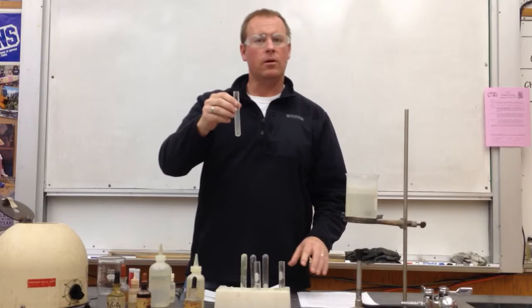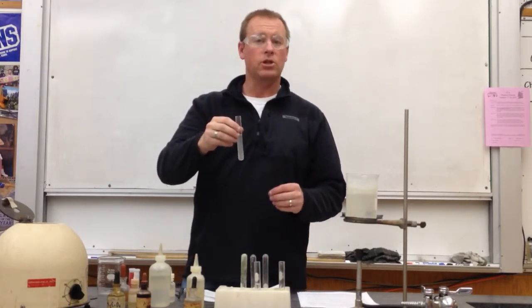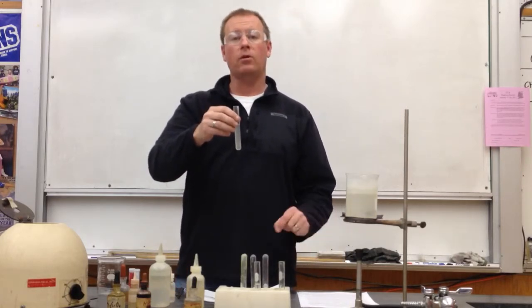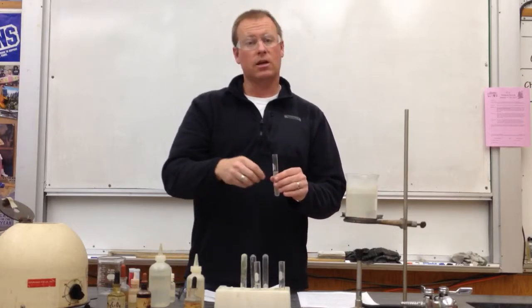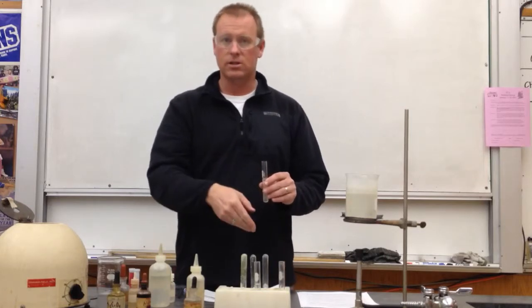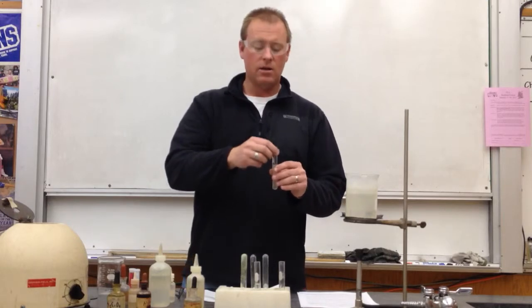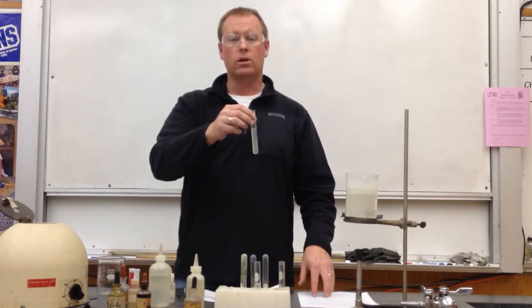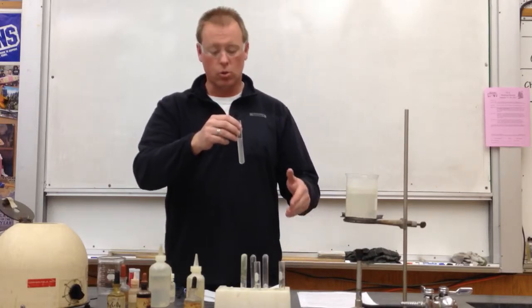Now, there's no way to tell if it's just barely basic by looking at the litmus paper and saying that the red paper just barely turned blue. Instead, what this means is that we're going to add a couple of drops of ammonia, stir it and test it. If it's red, it's still acidic. Add 2 or 3 more drops of ammonia, stir it and test it. If it's still red, it's still acidic. 2 or 3 more drops of ammonia to add. Stir it, test it, and if at that point it's turned blue, then we know it's basic and we know it's turned blue within just the last couple of drops. So that's what we're going to do.